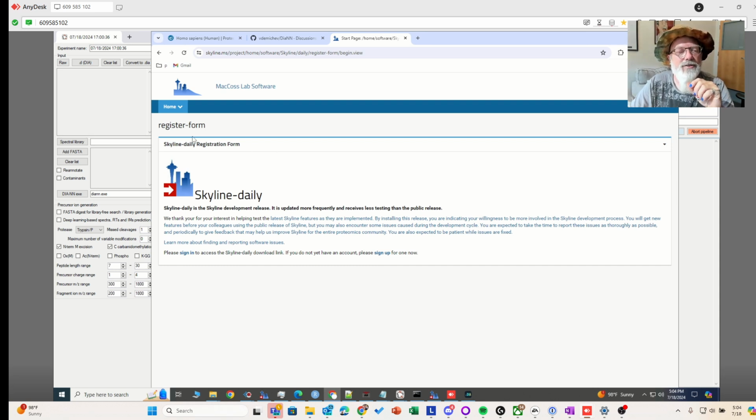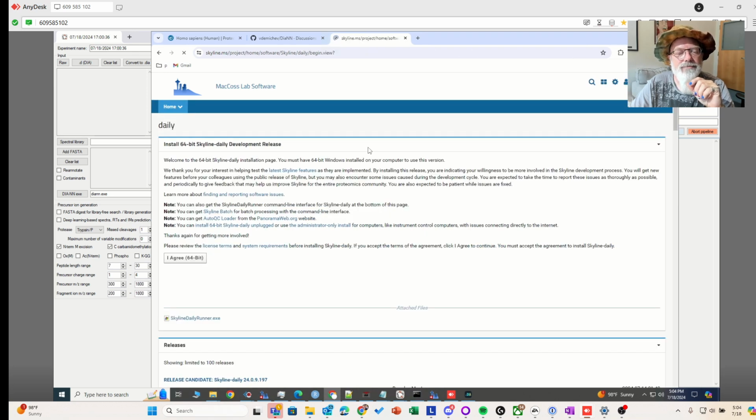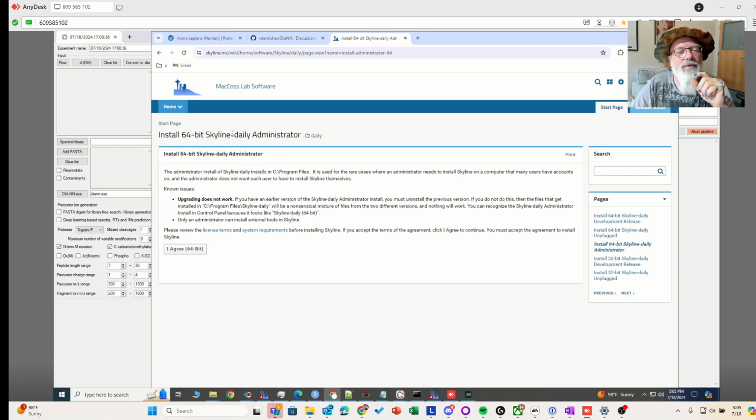To download Skyline Daily, you go to skyline.ms, and you need to sign in to access the daily download link, and I have already signed in. The one you want to download is the administrator only install. You don't want to just download the regular one; I do not think it'll work. So download the administrator only install, hit agree, and it should download as a file.